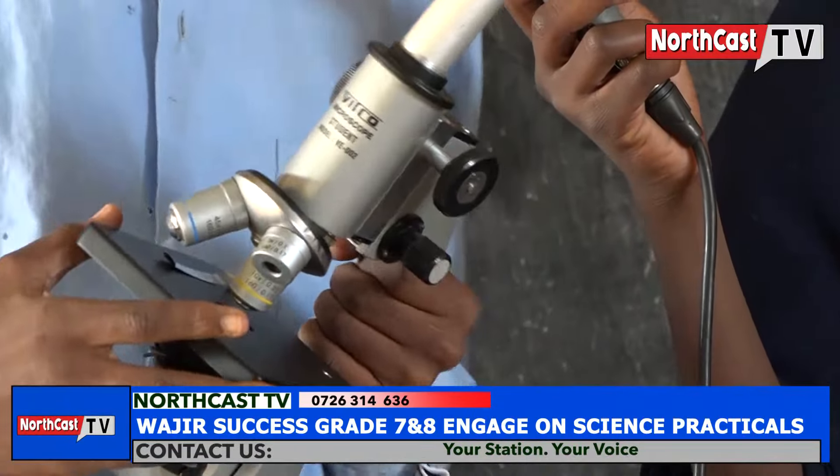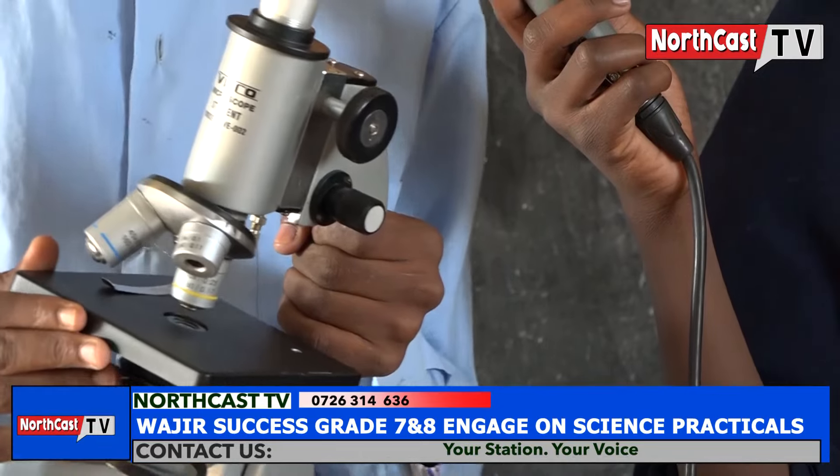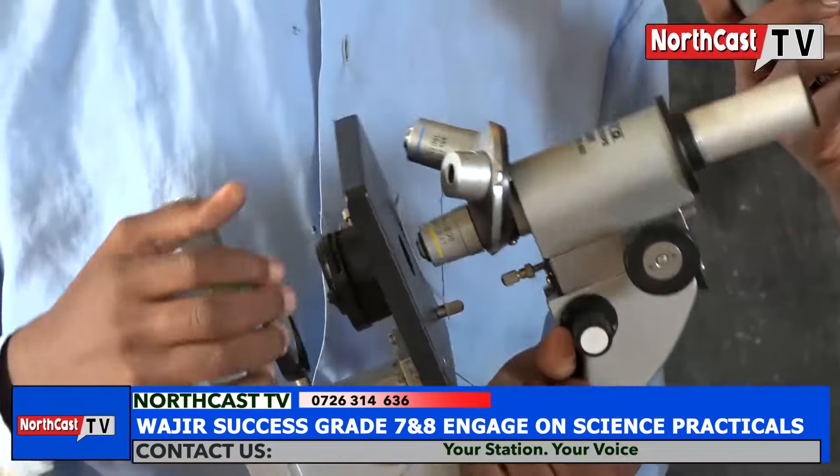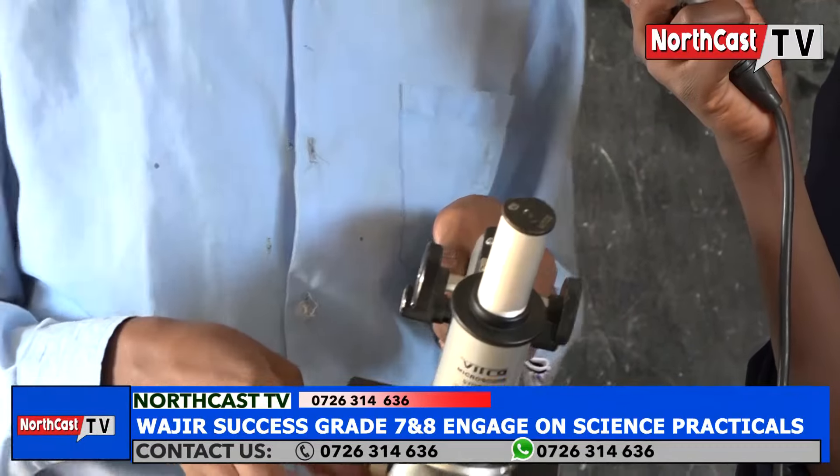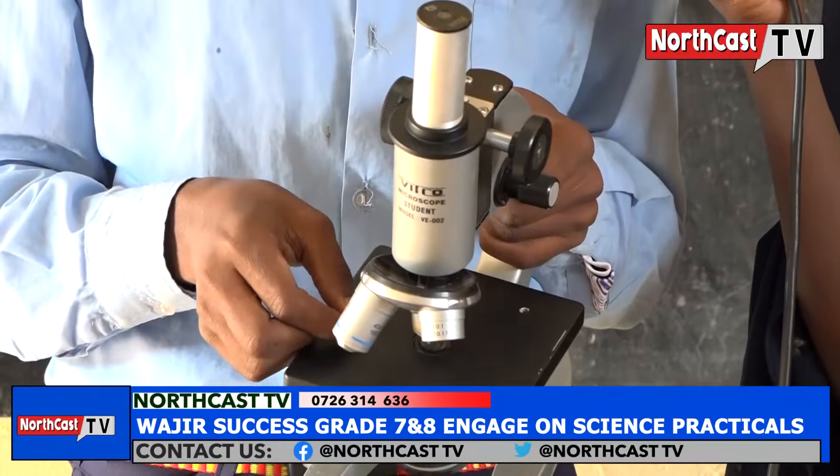The other one is the stage. The stage is where the specimen is placed. The other one is the clip. The clip holds the specimen in place.